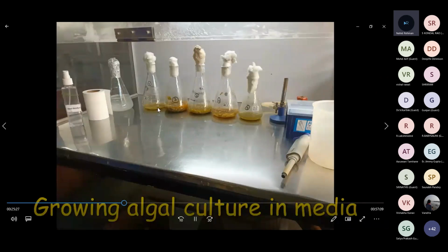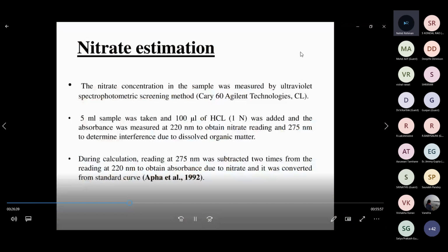And then the algal culture which you want to use for extraction, you can take and start working. But before starting the experiment, always switch off the UV, keep it for 10 minutes, then only you open the hood.